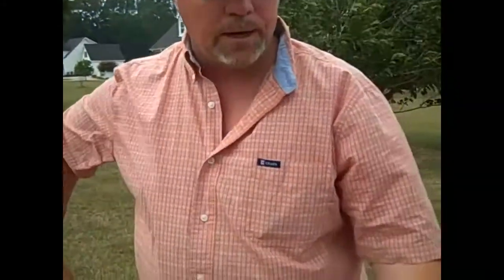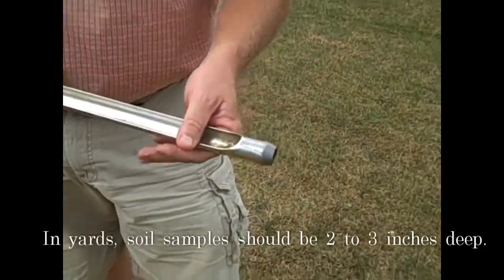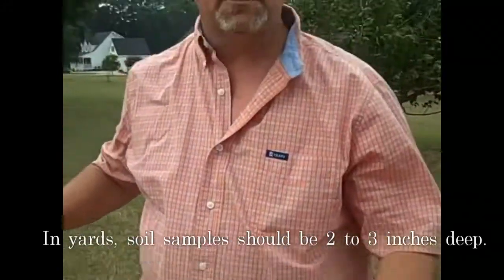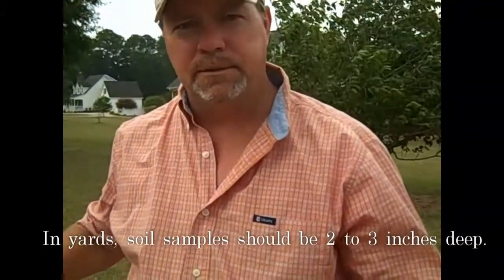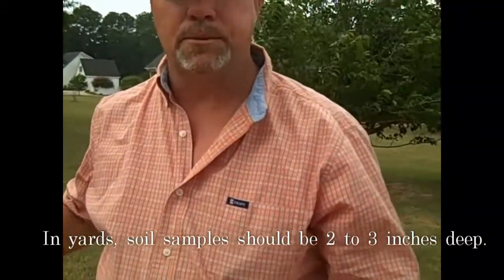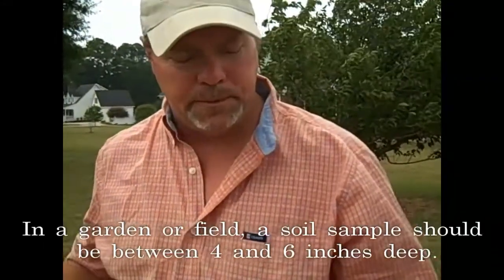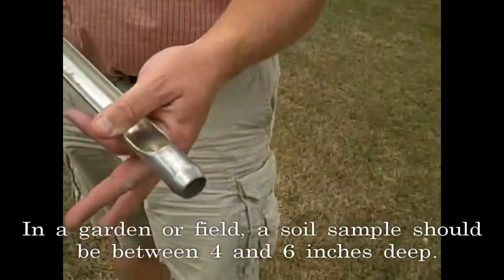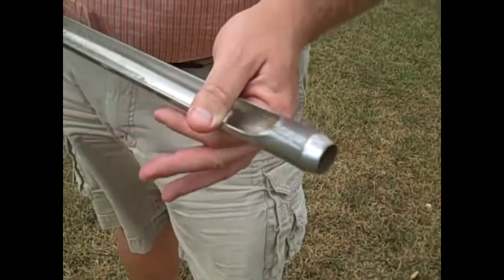The next thing you need to do is figure out what depth you're pulling your soil sample. Here in the yard, you're looking at two inches deep because that's where all the action is — the top two to three inches. In a field setting like a garden, four to six inches is where you need to be. So today we're going to be going about that deep to pull the soil sample.